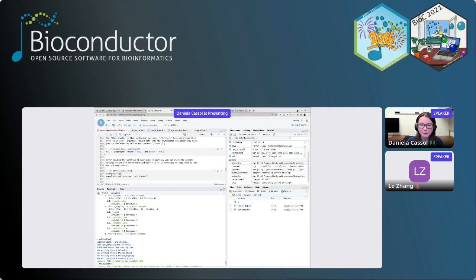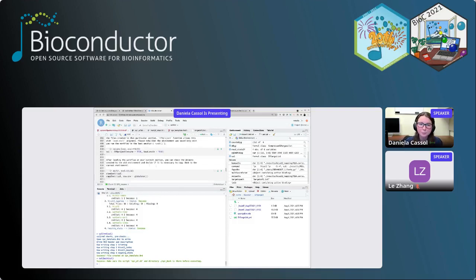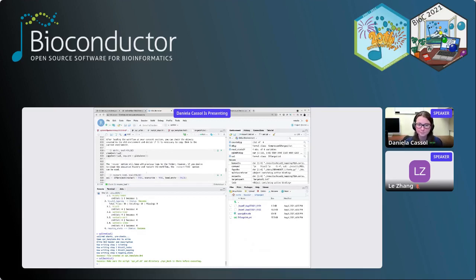The other possibility is, here in the SPR, when we use the run workflow function, we can save this RDS with all those objects. So it's also easy to resume because you can say resume true and then load that environment. So load all those files as well, in the new environment you create or in your global environment.